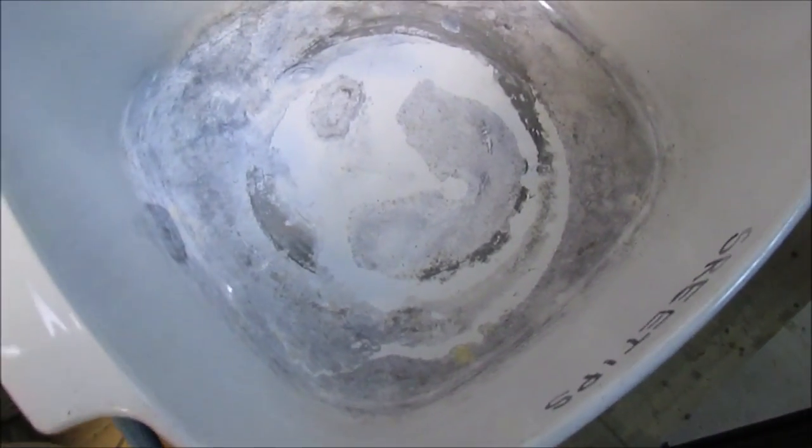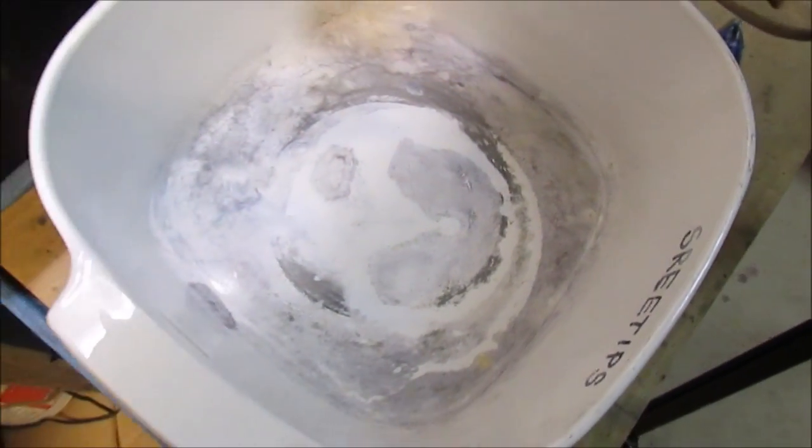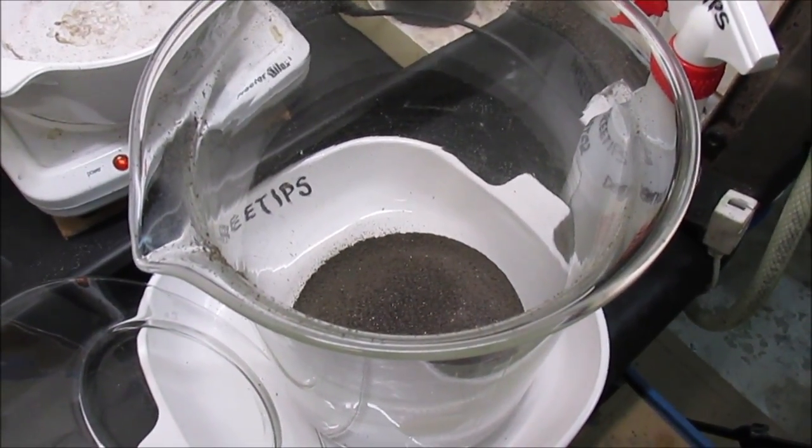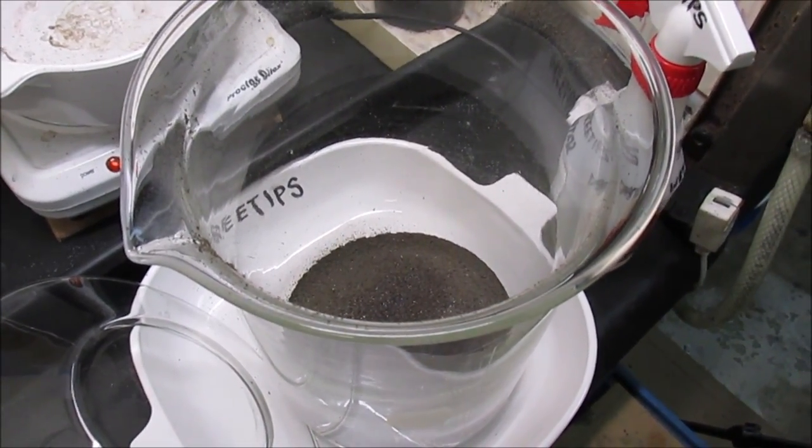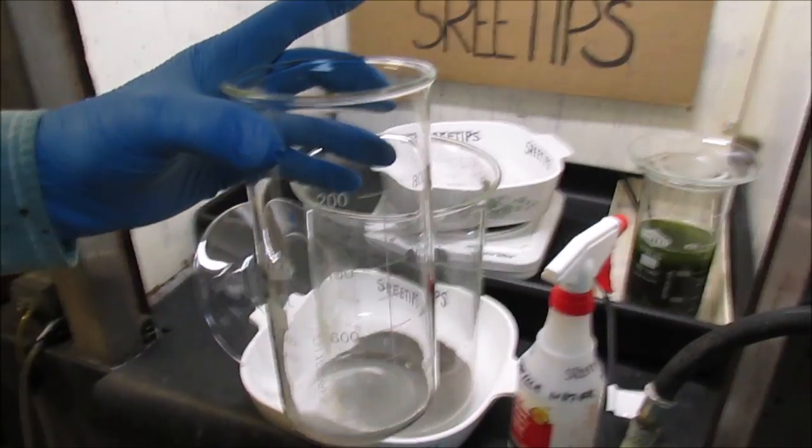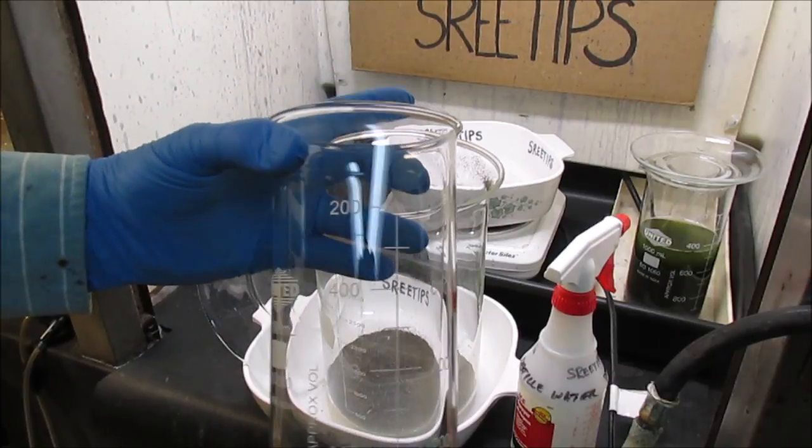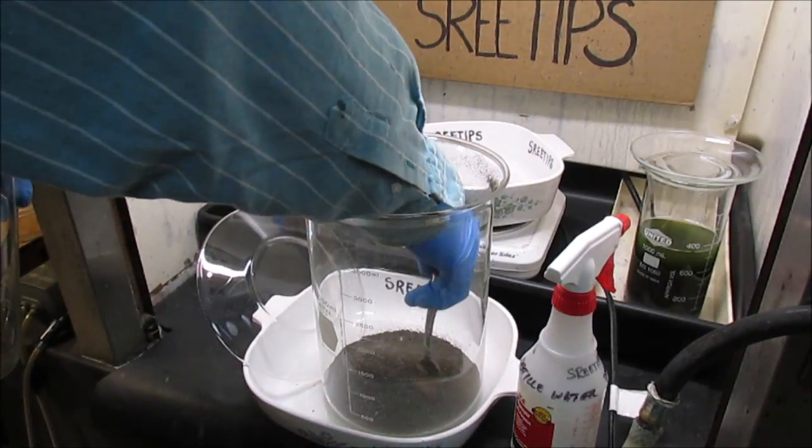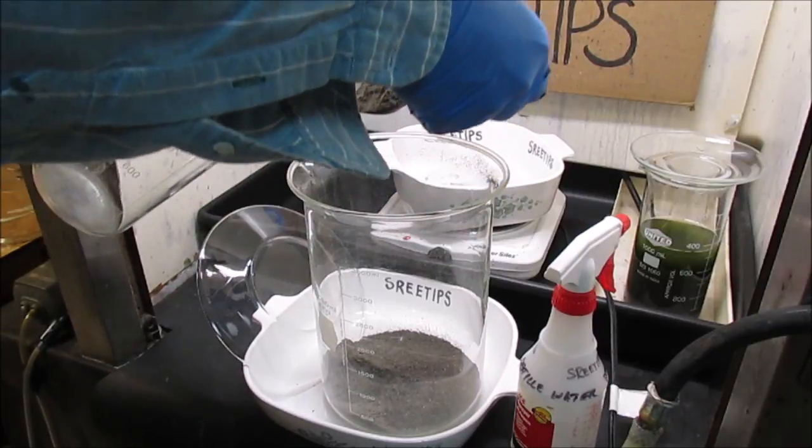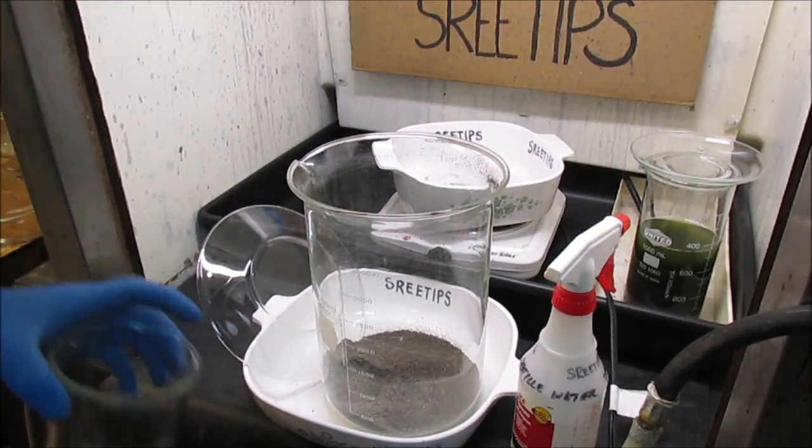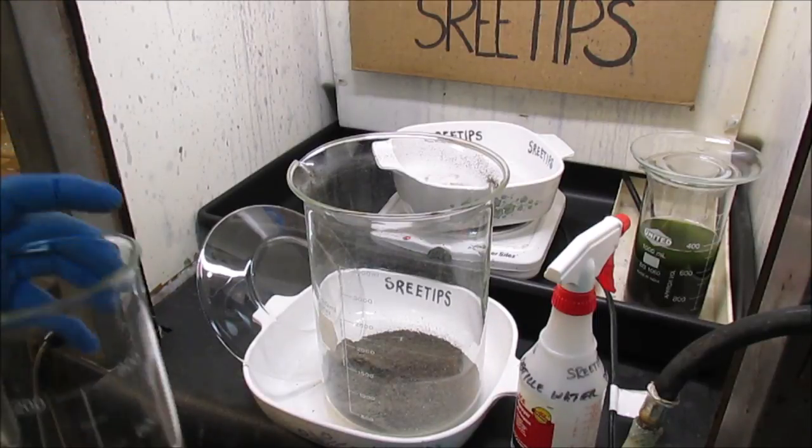I swept the contents of the pan into the strainer so it's nice and clean down here. We'll just set this off to the side and do some experiments with seeing about getting this ash processed for the metals. I'm going to put a tablespoon of this material in this tall one liter beaker here.